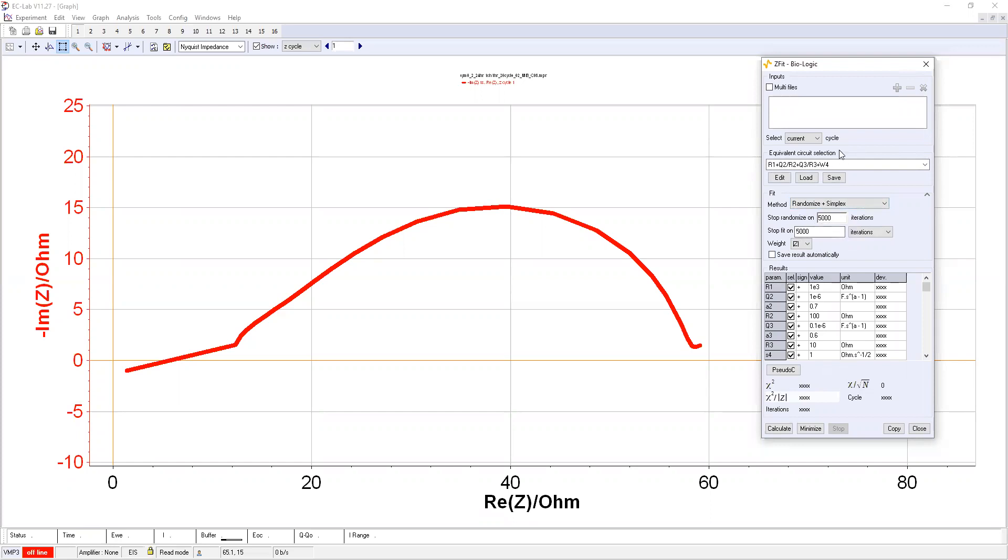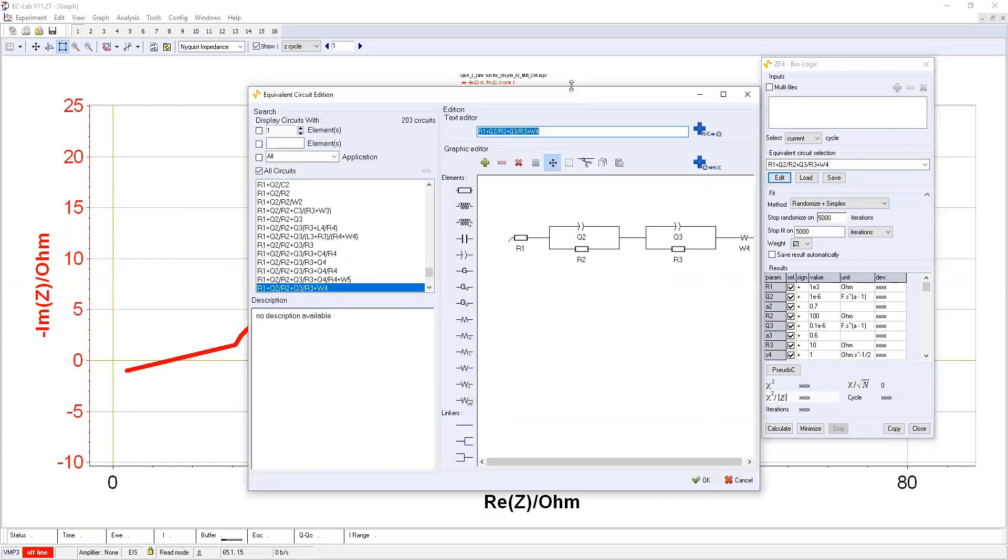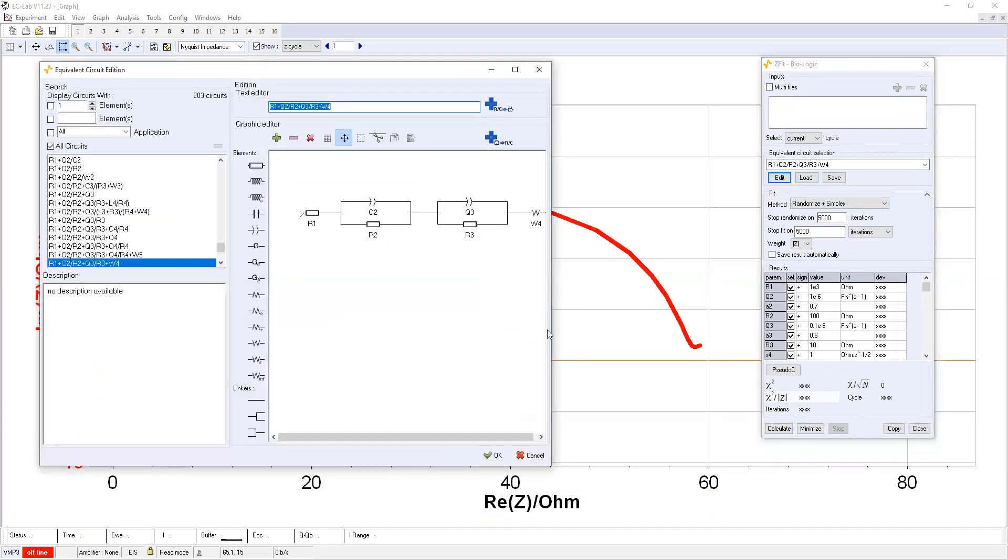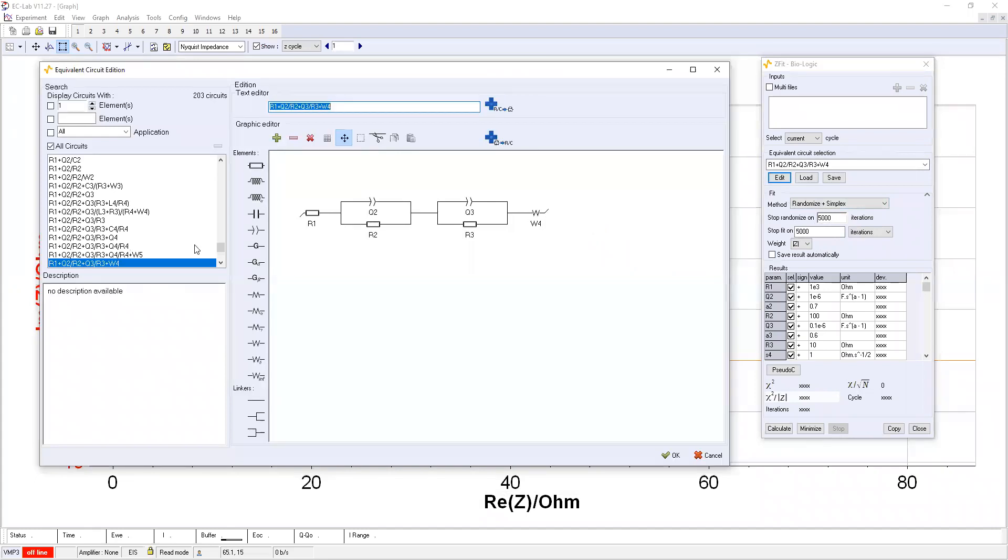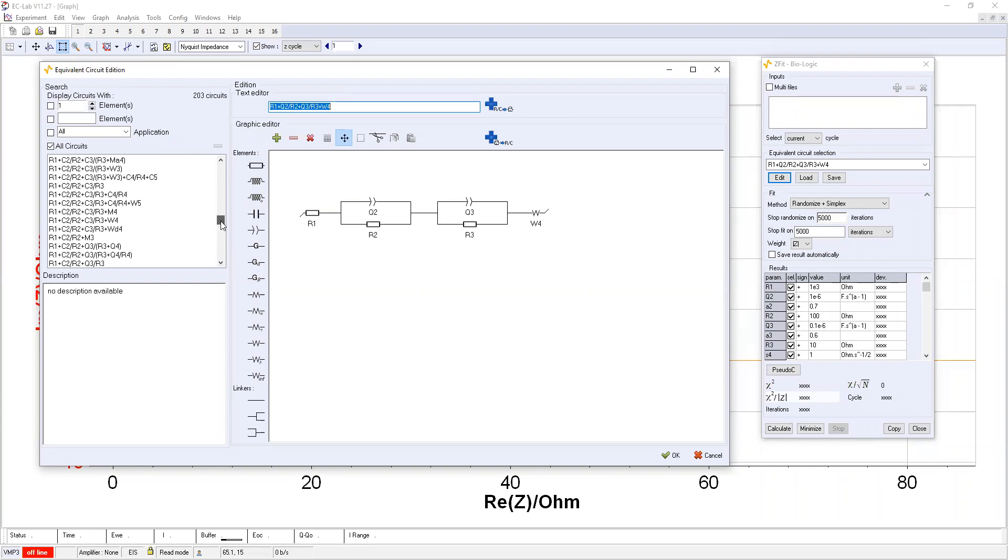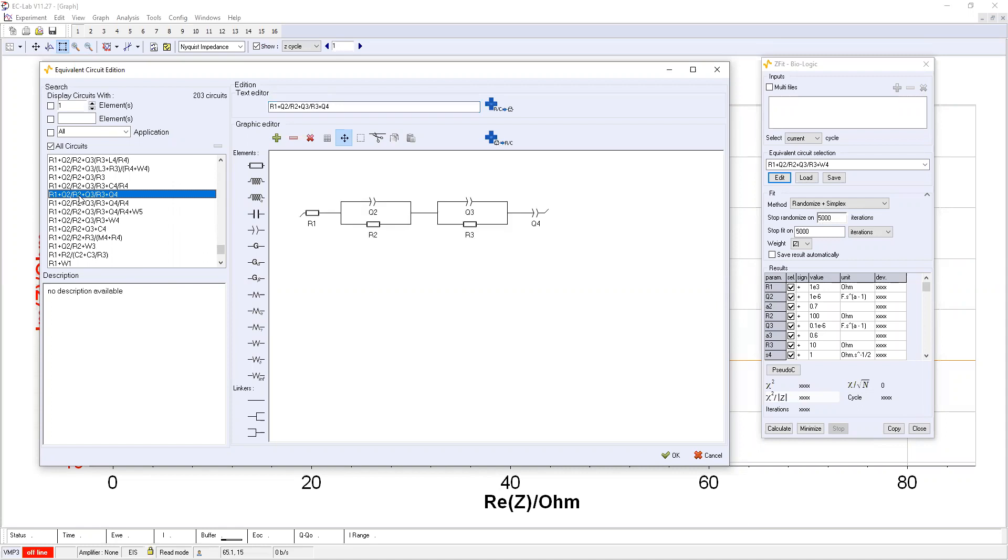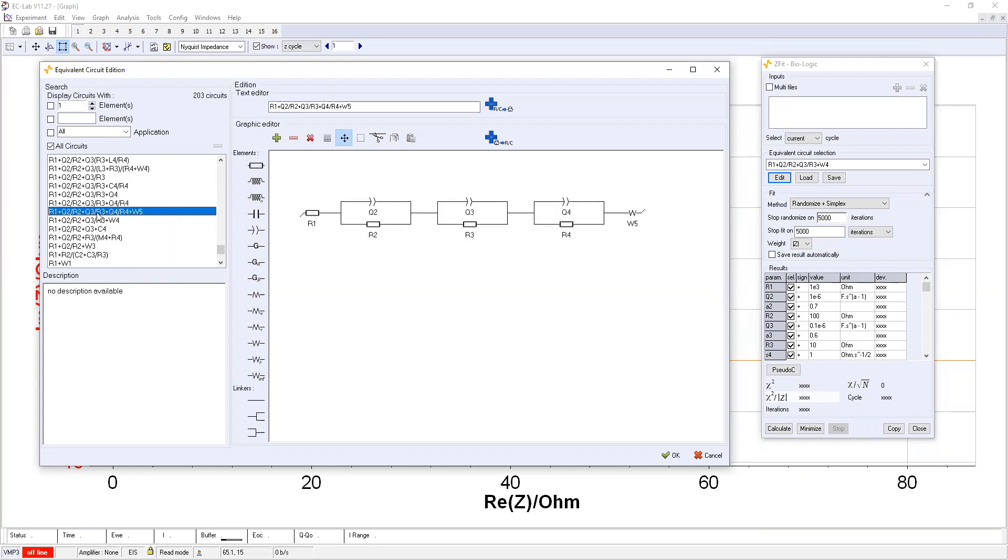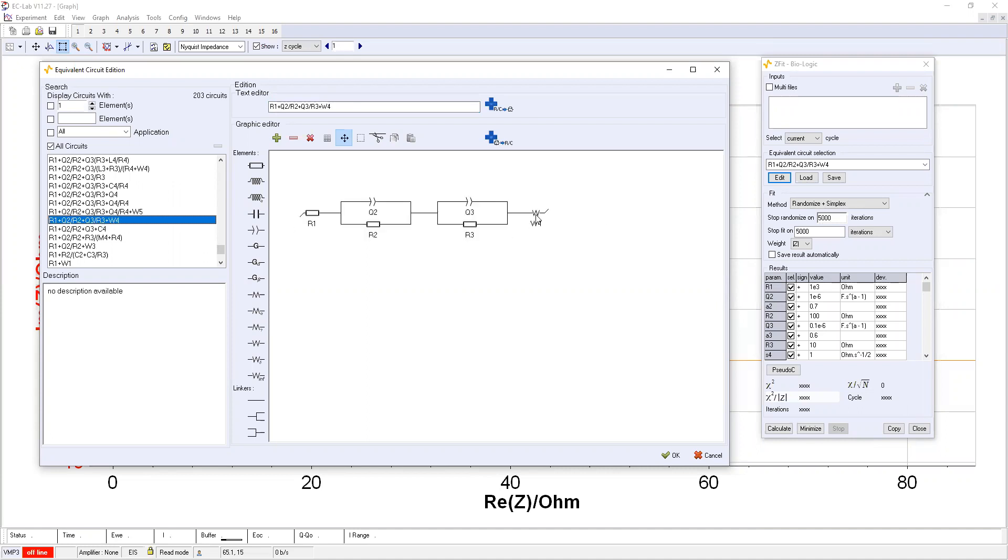Now the most important thing is the choice of the circuit model. So you can edit it. Here actually predefined mini circuit. This one is the two component layer model. This one is the three component layer model without Warburg diffusion. And this one with Warburg diffusion. And then this is two component layer model with Warburg diffusion.